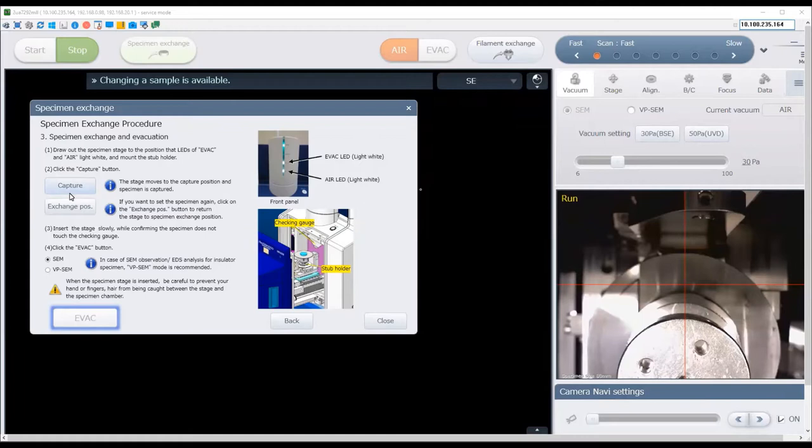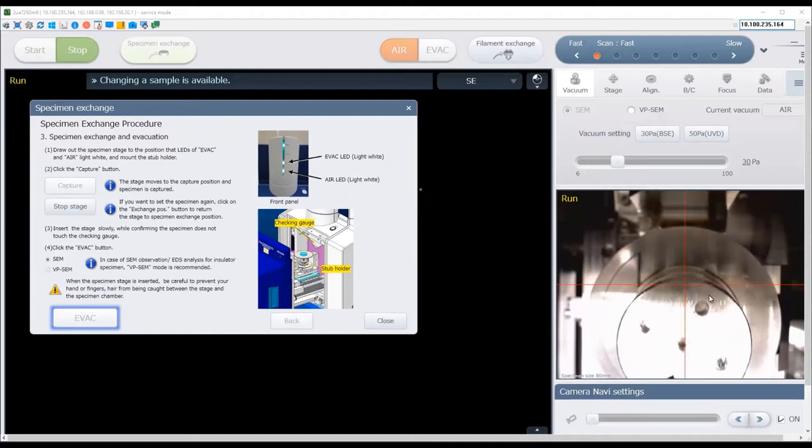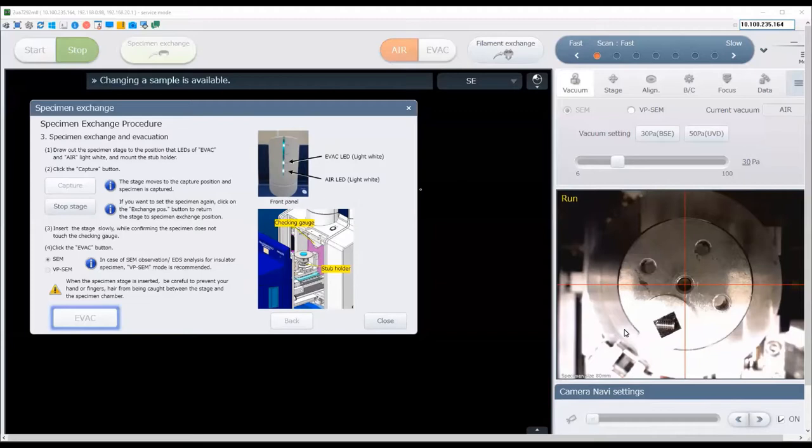Again, make sure both the evac and air lights are lit white, indicating the door is fully open. Now click the capture button. The stage will move underneath the camera and capture an image of your sample holder. Wait for the image to be captured, and if the image is okay, you may proceed. If you need to recapture it, click recapture. Next, insert the stage and click the evac button.